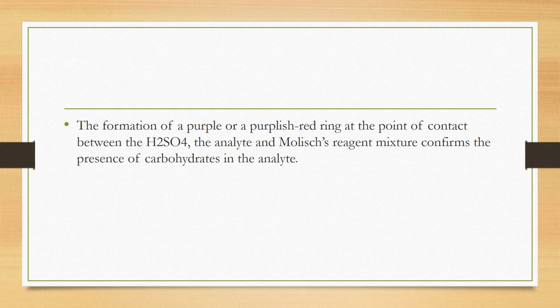The formation of a purple or purplish red ring at the point of contact between the sulfuric acid and the analyte and Molisch reagent mixture confirms the presence of carbohydrates in the analyte.